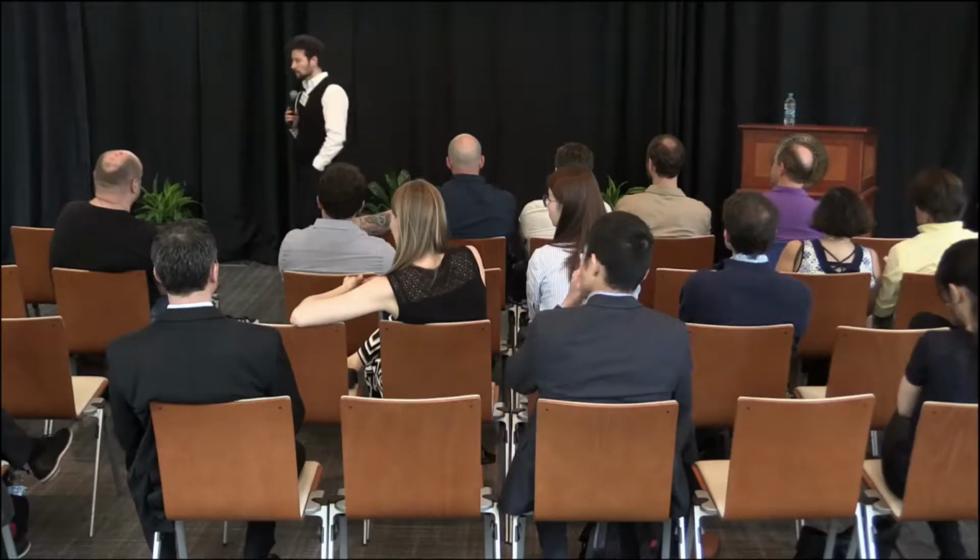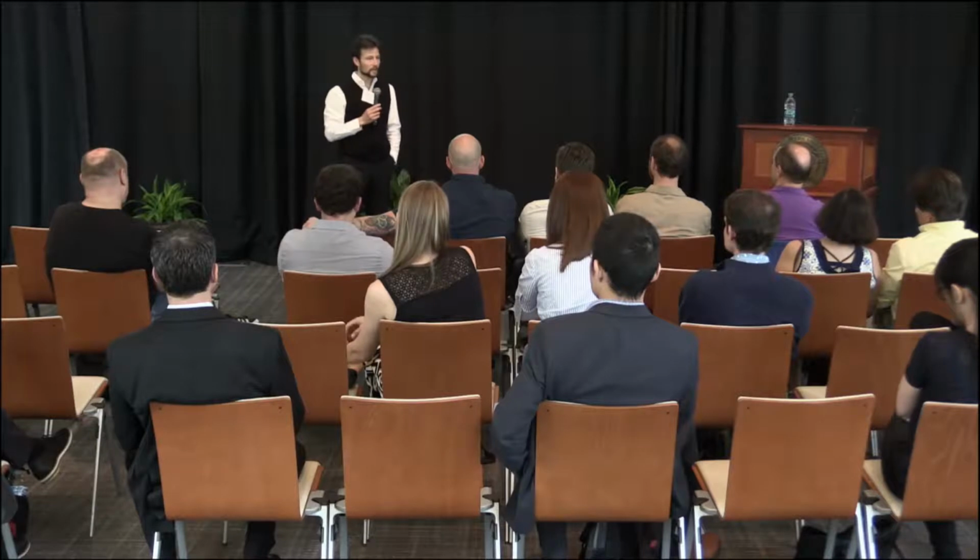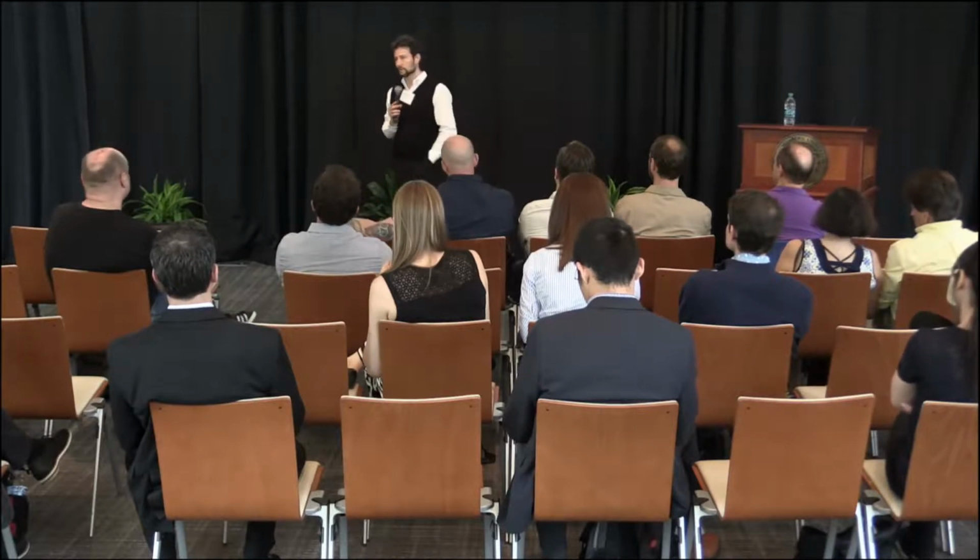Let's see. What are the benchmarks for quantitation that we can use? That's personally one of my favorites because I think it's incredibly important. This morning, John Yates said something that I think we should all learn from, that in the early days of analyzing mass spectra, there was a lot of good work happening and there was some not so good work happening, some sloppy identifications that instead of helping the field, contributed to eroding the confidence of the broader community and perhaps delayed the adoption of what was otherwise inevitable and very good change to the way mass spec data was analyzed.